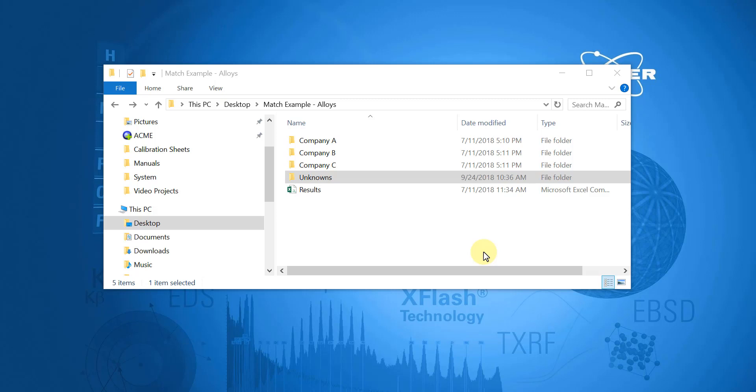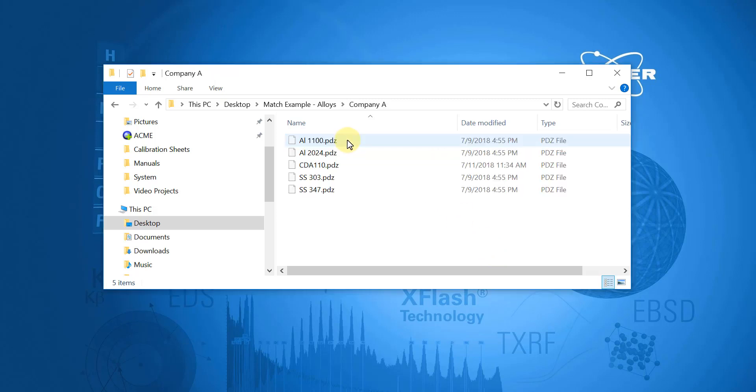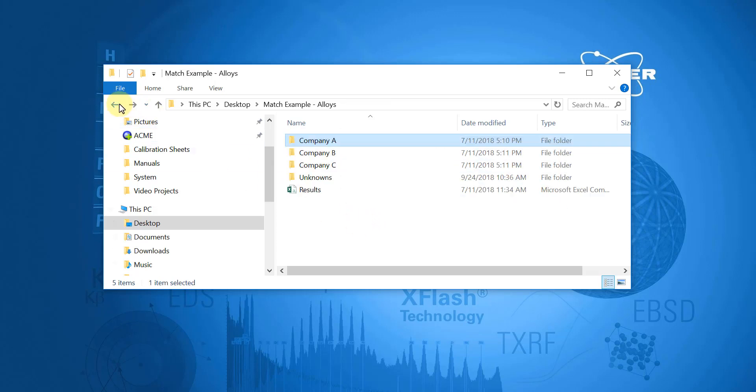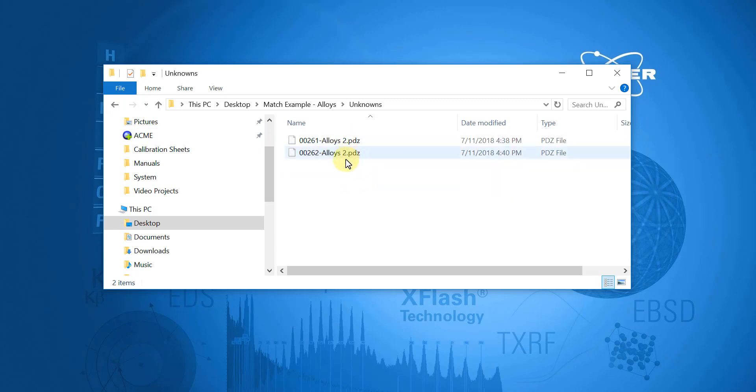However, raw data collected on the handheld XRF is given a default and numbered file name. So after all the raw data is collected, the next step is to rename all of those PDZ files to a name that better identifies the material or chemistry. So in this example, I've already organized the spectra into their respective folders and renamed them according to their Alloy ID designation. I also have a separate folder for all of my unknown samples, which do not have to be renamed.